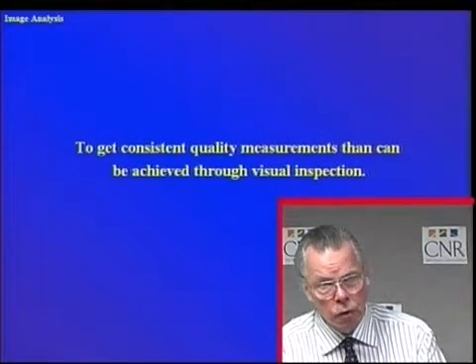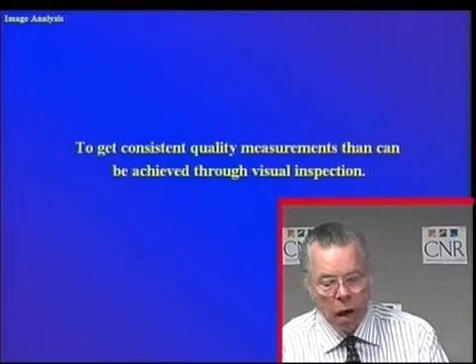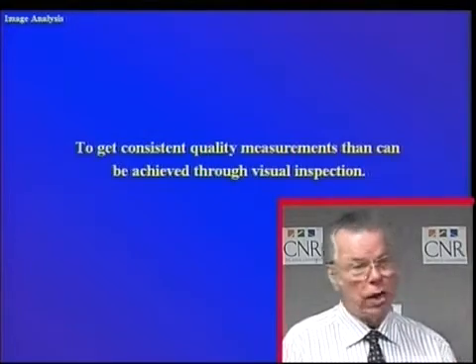These are used for analyzing the final product as it comes out the back door of a mill that is shipping pulp to another mill. The transition is quantified using the TAPPI measurement standards. The other method is one that is used to control the process itself. Not quite as sophisticated, but is more revealing and indicative of what is necessary for the process.